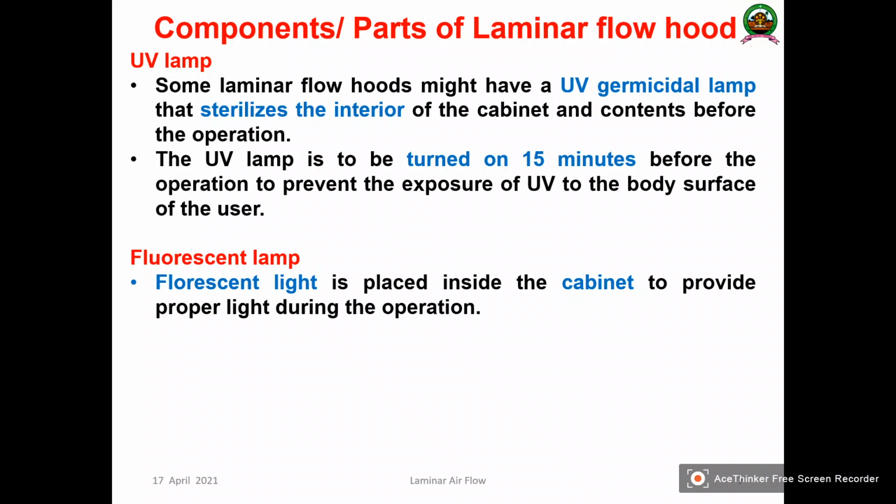When the UV light penetrates the microorganism, through photochemical oxidation the nucleic acids are damaged by the formation of thymine dimers, or pyrimidine dimers, which cease metabolism and prevent the replication of the DNA, and the microorganism dies.